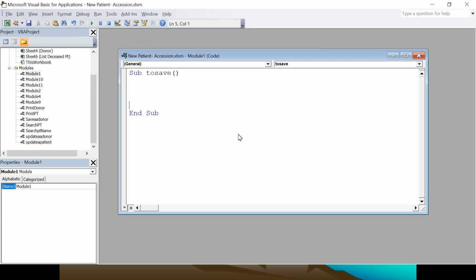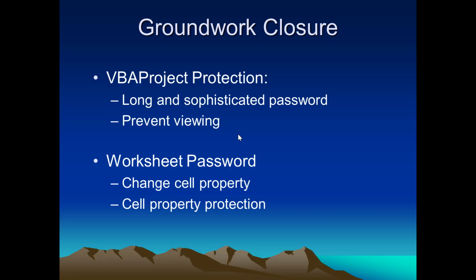Once you know you will use ADO to program, the condition is already set. Next step is just how to program. Before I save this interface, remember two things. First thing is when you do program, because the program includes the password and the username, you don't want regular users to see it.